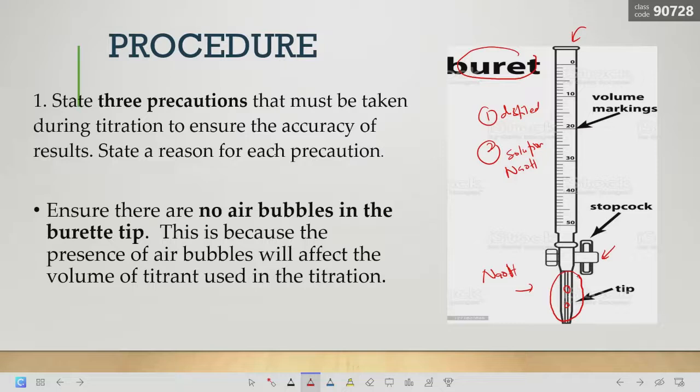Your titration is not accurate. So make sure there is no bubble in the burette tip. This is very important for the titration. Make sure when you lalukan NaOH ni, you buka stopcock ni dan you penuhkan NaOH dia sampai dalam ni, penuhkan, baru you tutup. Yang ni you letak beaker dalam ni. You letak beaker, bila dia alihkan dulu, baru you tutup stopcock ni. Kalau keadaan macam ni, maksudnya dia open. Kalau you buat dia macam ni, horizontal, dia akan jadi close.